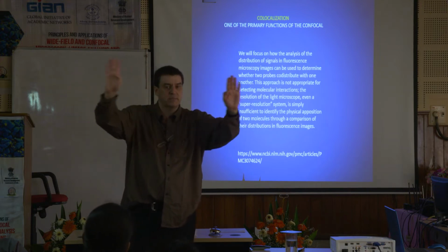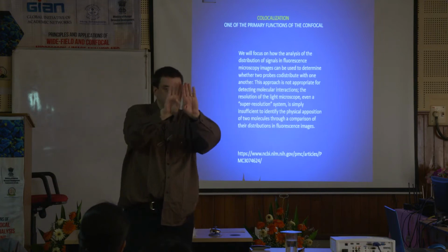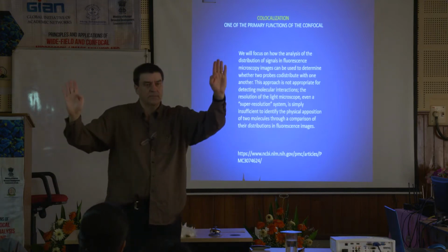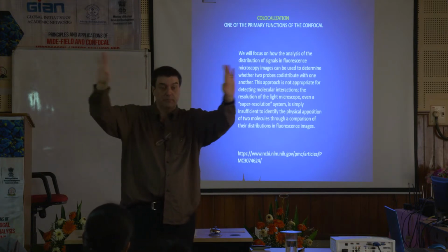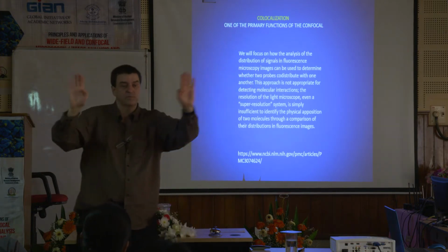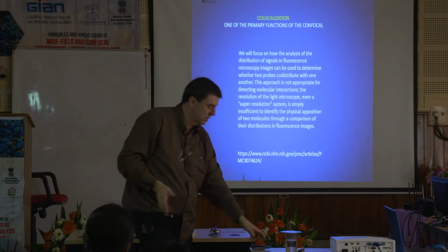I like to spectrally separate myself as best I can so I don't run into bleed through. I pick fluorophores that are spectrally far apart so I don't fool myself into thinking it's co-localization when it's nothing more than bleeding.